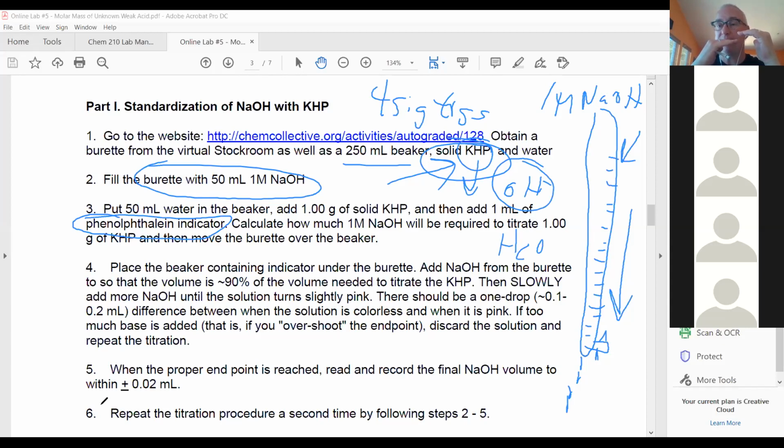And the pH will go from being low to being really close to 7 and then going past it. At that point, the phenolphthalein changes color and becomes pink. At that point, we have precisely the same amount of KHP and hydroxide. But what you need to avoid is adding way too much sodium hydroxide, because that color is pink too. I mean, that's also pink.